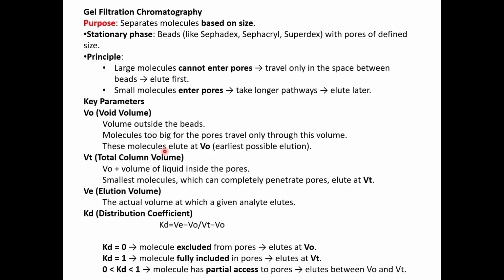So here comes the column volume, the void volume, the elution volume when you actually perform the column chromatography or the gel filtration in the column. You have a column where you will have your beads, of a certain bed volume. Here you have something called the partition coefficient.